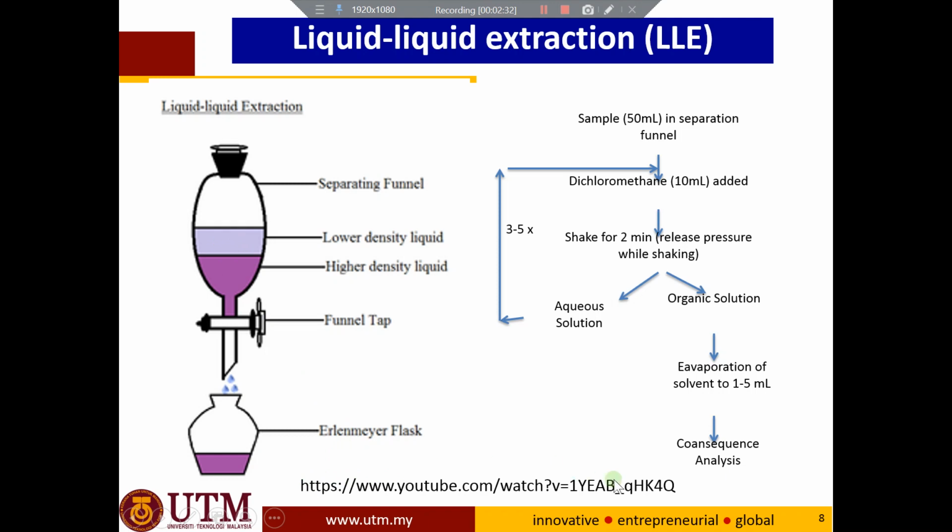You can use this link to watch the procedure of the liquid extraction using the separating funnel. Okay, but this is the old method of the liquid extraction, but again it's widely being used all over the world. Nowadays, major research and scientists already explore the capability of micro liquid extraction. Maksudnya diorang guna liquid extraction, instead of they use 100 of mil, they will only use less than 1 mil of extraction process.